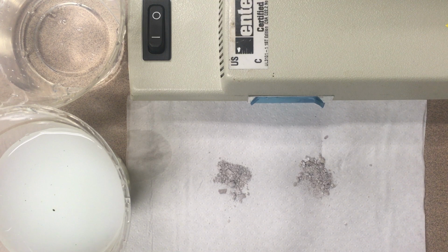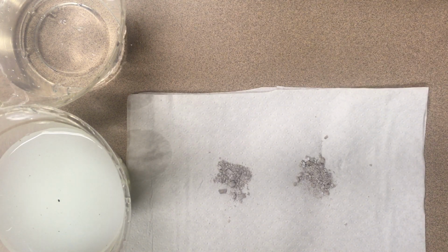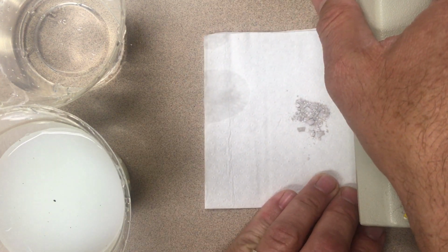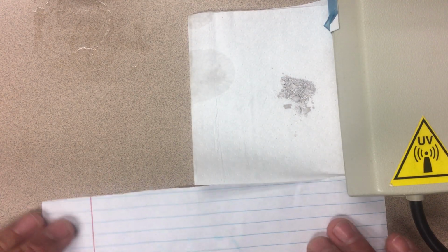What I also have here are some samples of solid silver chloride that were collected years and years and years ago. They've been kept in a somewhat dark area, but the white has started to turn a little bit gray. But I'm going to accelerate this a bit by using a long wave UV lamp here, and I'm going to shine it on this pile. I'm going to put this up in the corner here while I talk about some of the reactions involved.